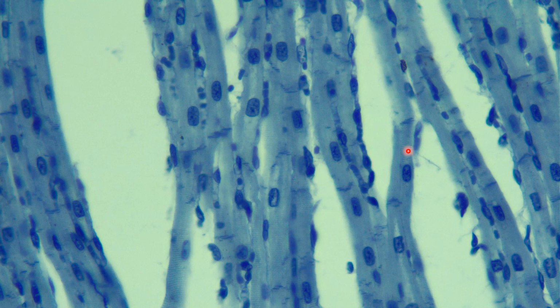And another thing I like to point out, do you see these dark lines right here? Okay. These dark lines are called intercalated discs. Intercalated discs are where one cell connects to the next, and you're not going to see that in skeletal muscle. You'll only see that in cardiac.